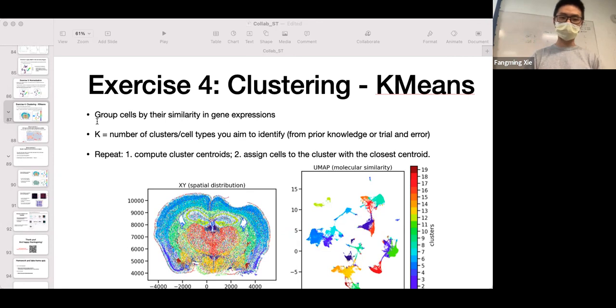Now, this is a much more manageable size than the original cell by gene matrix. It was 80,000 cells versus our genes. Now it's 10 clusters versus our genes. Now we can actually visualize this matrix with a heat map. So let's make a heat map with this as an input and see what it actually looks like. Okay, so you see some patterns. Each row is one cell type, each column is one gene, but because you have so many genes, it's so packed. So let's change the figure size a little bit using a similar trick we did yesterday. We want to set the figure size, make it wider, let's say 12 by 5, I don't know.